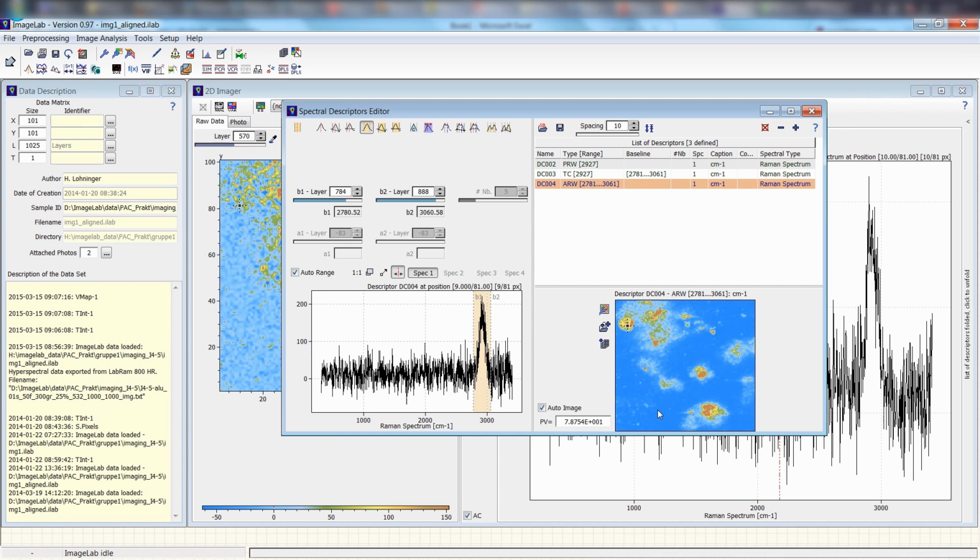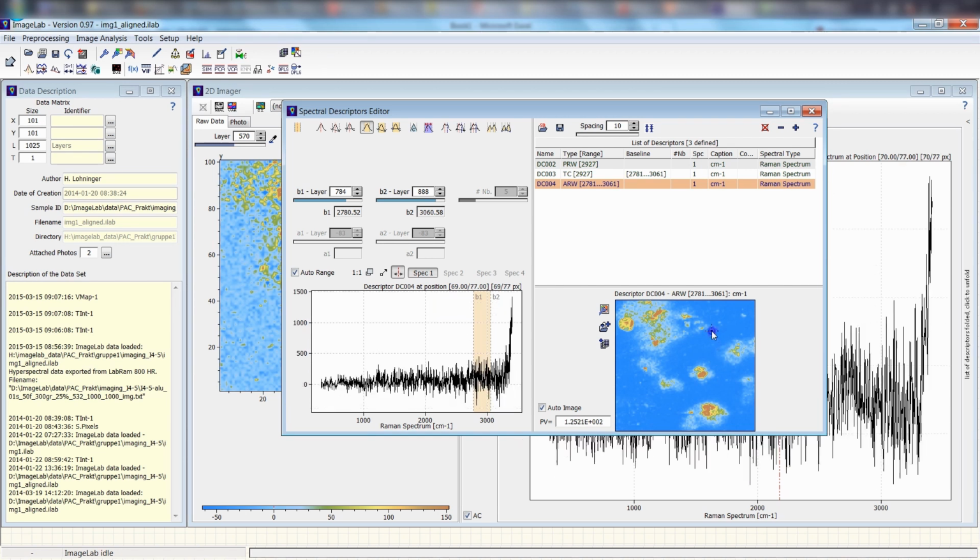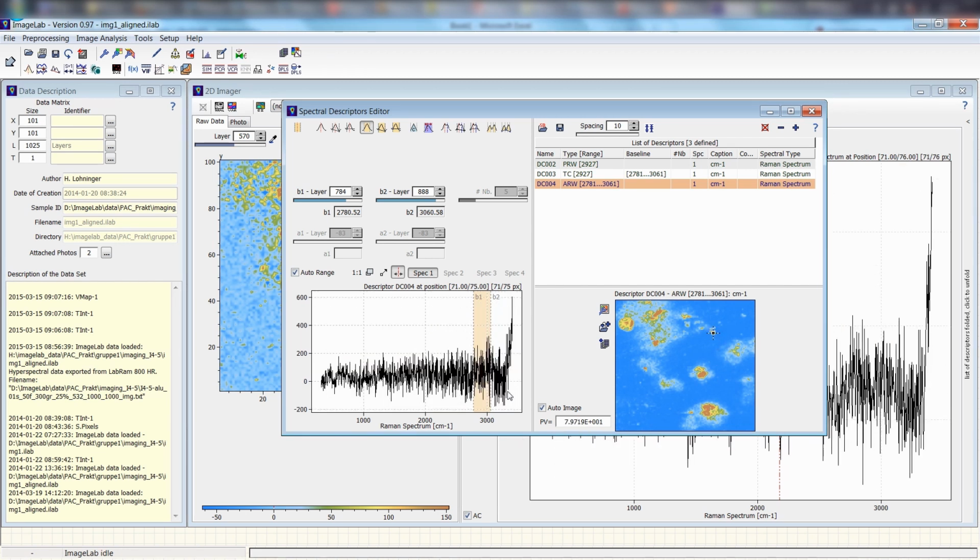And of course the integral is the reason why this image is smoother, because the integration removes part of the noise in the data. But there are some fake peaks or fake spots which are maybe just spots which happened to be created simply from the fact that the noisy data is just on the average not 0.